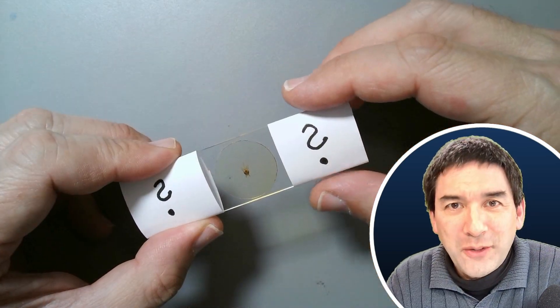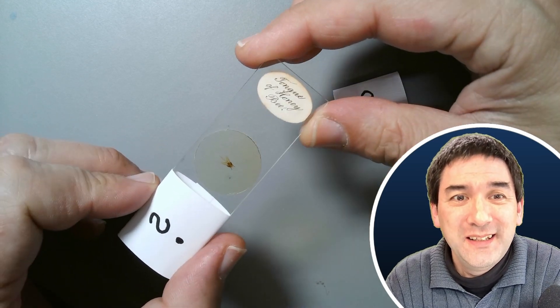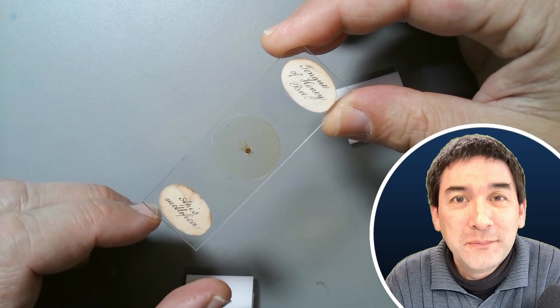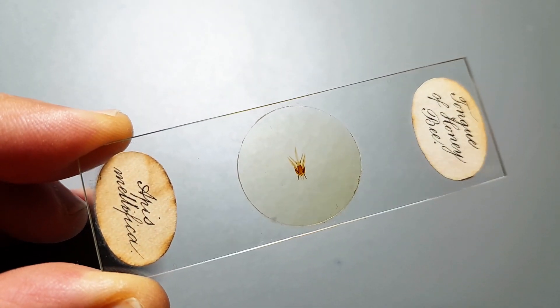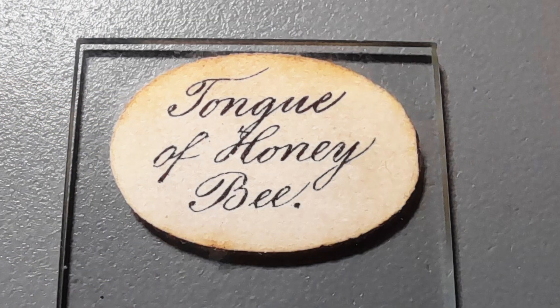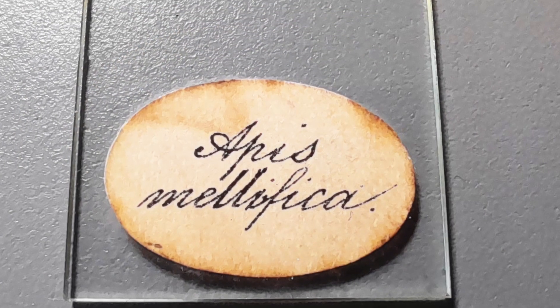I'm now going to reveal the specimen, and for this reason I have to remove the paper cover here. It is indeed the tongue of a honeybee. Here is the binomial, the Latinized name of a honeybee. This slide is probably around 100 years old, and from the quality of the specimen it's clear that the person who made it put quite a bit of time and love into making a slide like this.